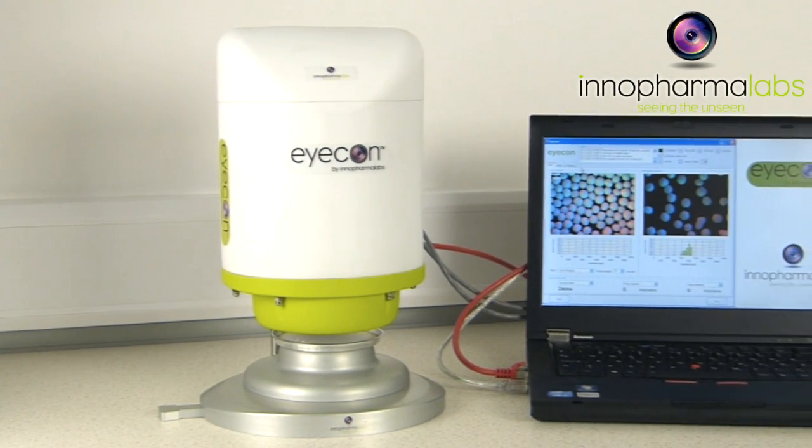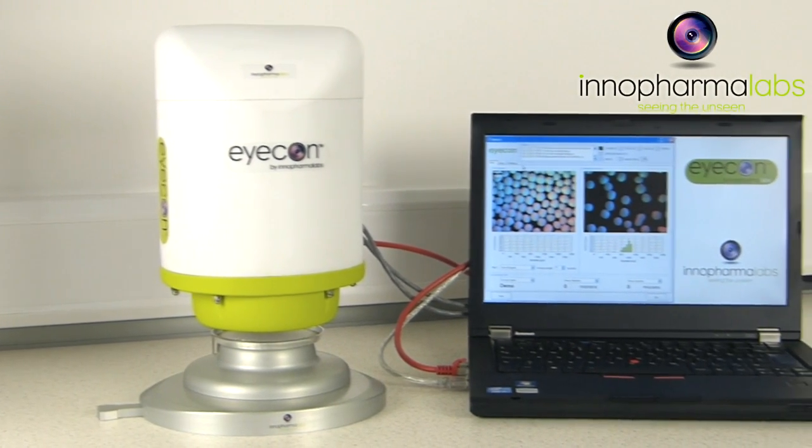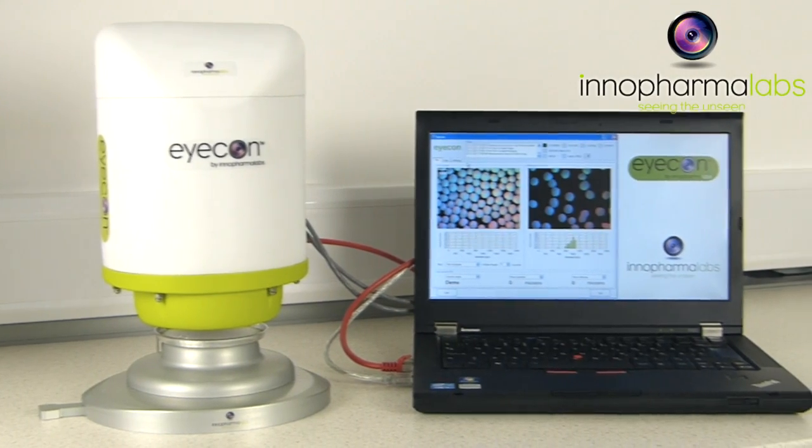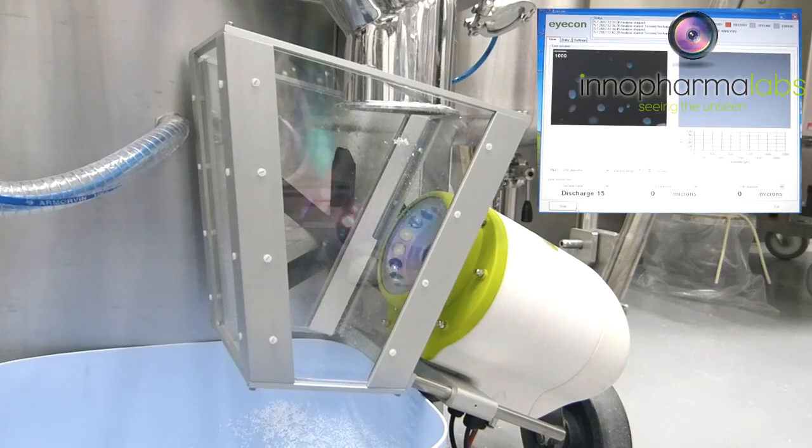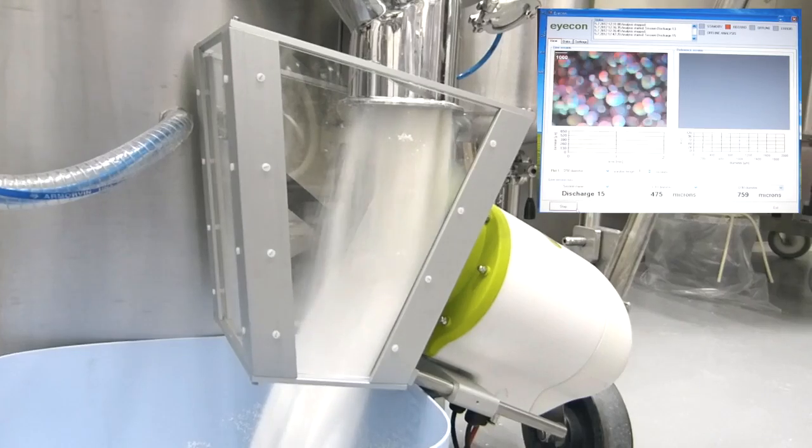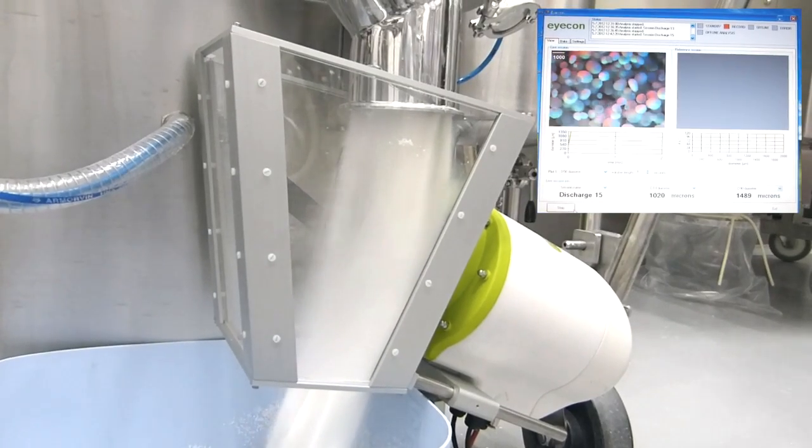Shown here in its benchtop analysis setup, the ICON can be used either to analyze offline or at-line samples, or can be placed in-line by means of a custom-designed integration device.